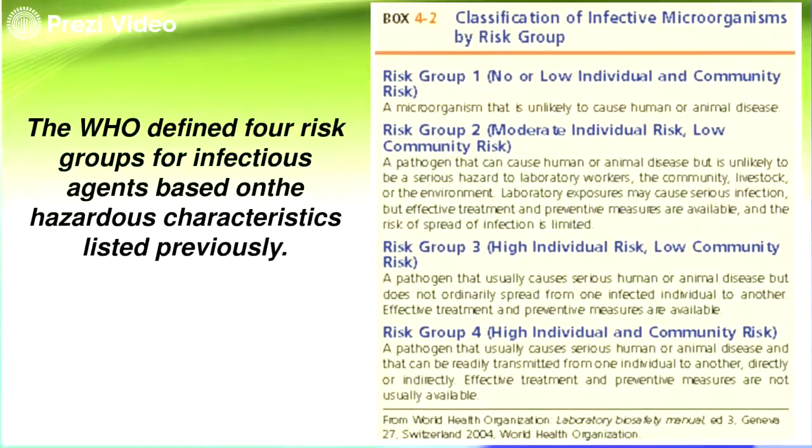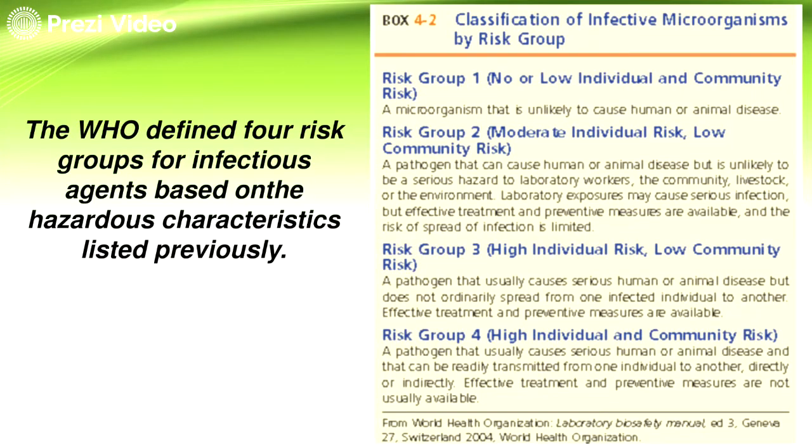So, under ng Biorisk assessment is the grouping of the infectious microorganism. So, you have different risk groups. Risk group 1, ibig sabihin niyan, walang problema sa microorganism. The microorganism is there, but it is very unlikely to cause any disease at all. Okay? So, yung mga microorganisms na ito yung mga microorganisms that are part of the environment. Yung tinatawag natin na normal flora. Okay? Kaya nga naman, hindi siya pwede mag-cause ng sakit.